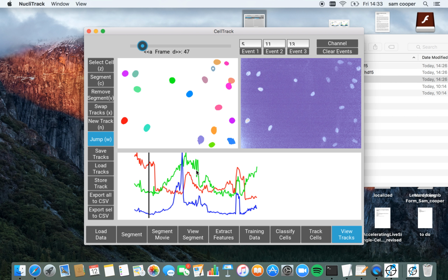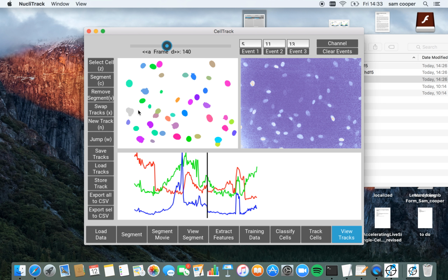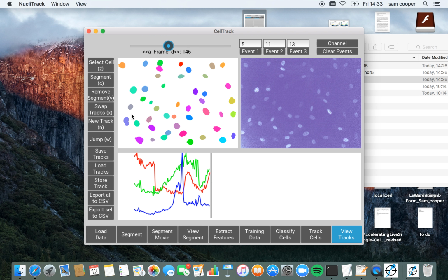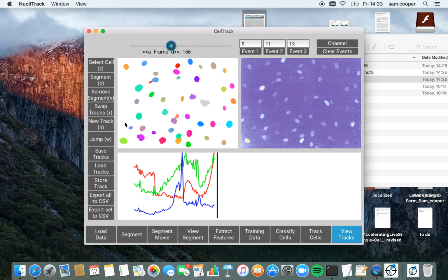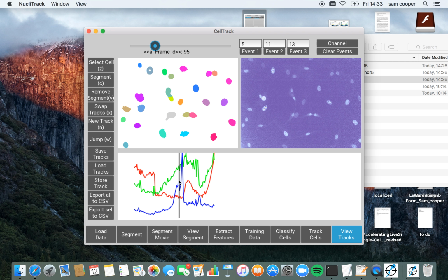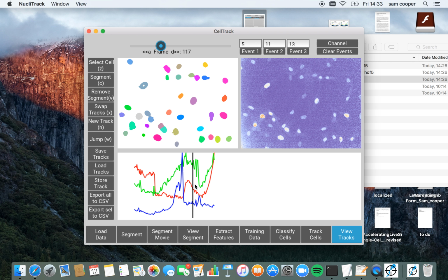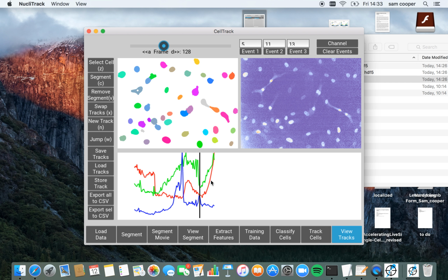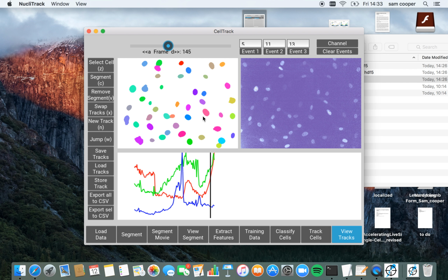So here is perhaps another mistake. Here the cell is undergoing mitosis, before another mistake is made here. I'm just going to correct this. And the second mistake here. And this cell nuclei disappears. So what we've got here is a cell that's exiting S phase, coming out with this peak in the foci measure, undergoing mitosis here, and then P21 in red starts to shoot up again. I'm going to choose a different cell to try and get one which is tracked a bit longer.